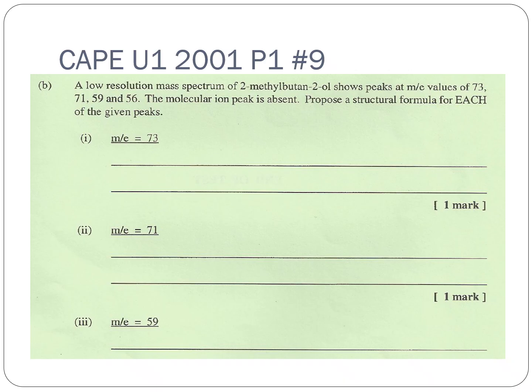They've given you the actual structure here, and because they've given you the structure, you are then asked to just come up with possible fragments. What is most likely going to be the piece that has broken off at a mass to charge ratio as given? They've also said that the molecular ion peak is absent.